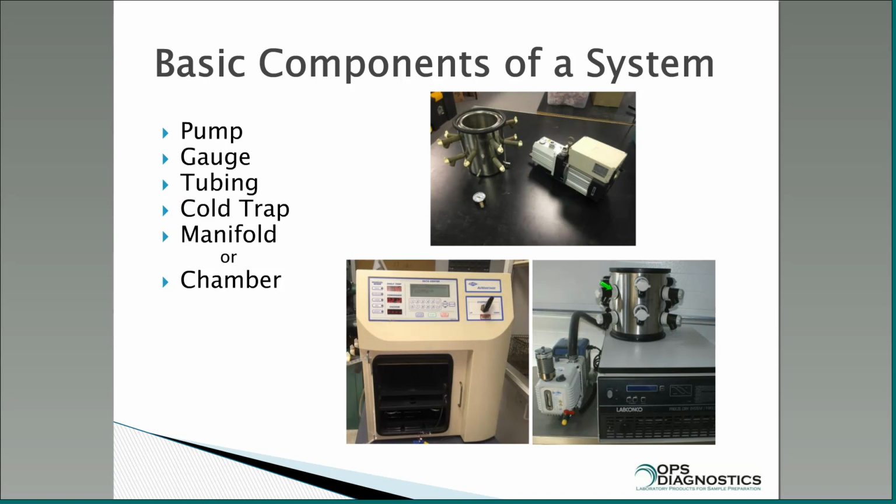This is a Labconco system, so you have these ports, and you can connect frozen samples in glass tubes to these ports, and then this is actually a cold condenser. So instead of putting something inside this pot, there's a coil in there that chills, which will trap your water once it leaves your sample, and then your pump.